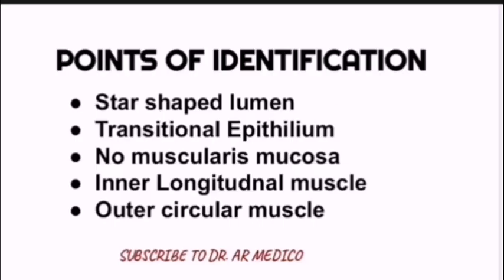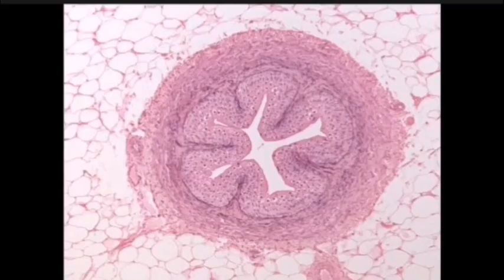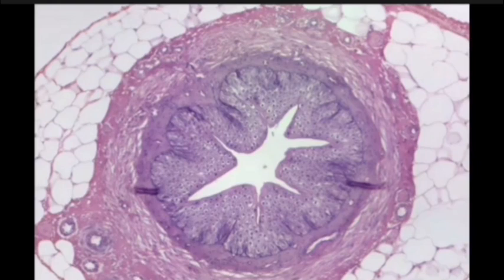The second point is the ureter will have a transitional epithelium. So what is transitional epithelium? It is a multi-layer epithelium, right? You can see the nuclei. Different nuclei are there. So multi-layer epithelium, it is not squamous, not columnar, not ciliated, right? So a different one, multi-layered, and here are the folds also visible, right? In this picture you can also see the darker nuclei can give you an idea that these are multi-layer epithelium, right?